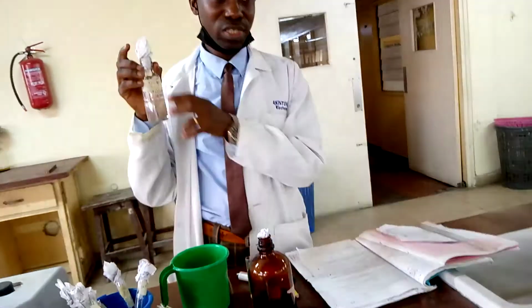We know the concentration, 5 milligram per mil, and then we can do a serial dilution. When we have done the serial dilution, we can use that to estimate for an unknown. I hope you are getting that.